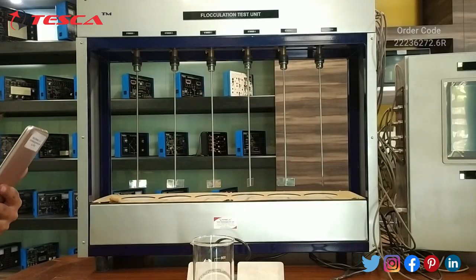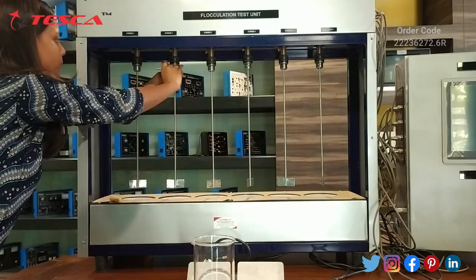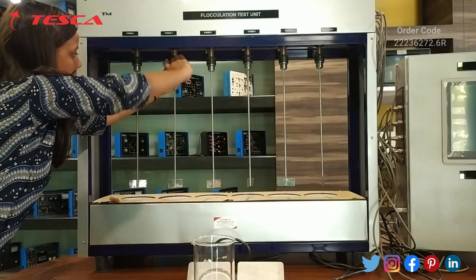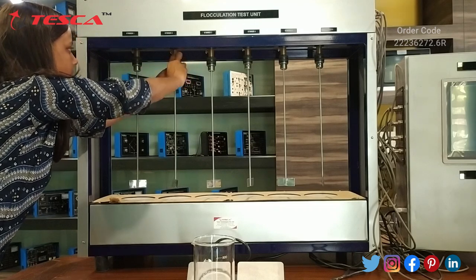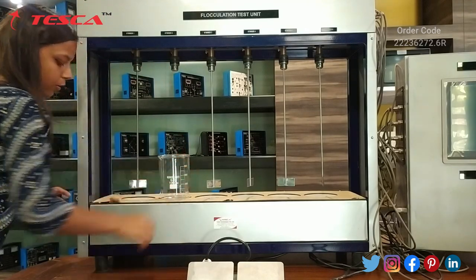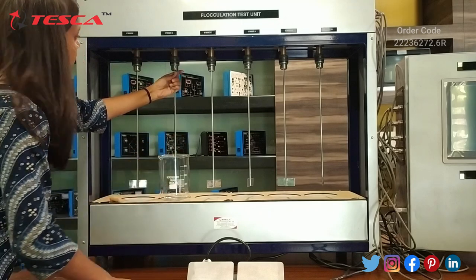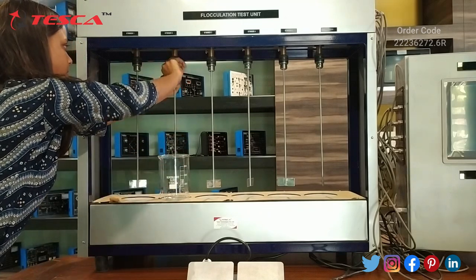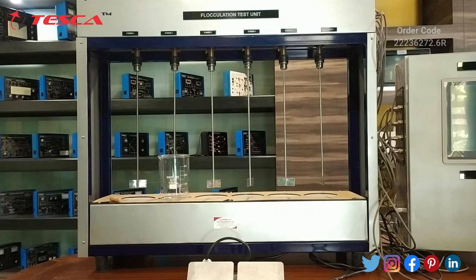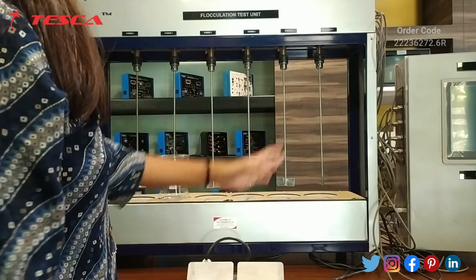Now let's learn about the working of this flocculation test unit. From here we can unplug this stirrer rod from its chuck using the provided key. Then you can simply place the beaker over there and replug the rod. Then we can control the RPM and timer from the control unit as described before.